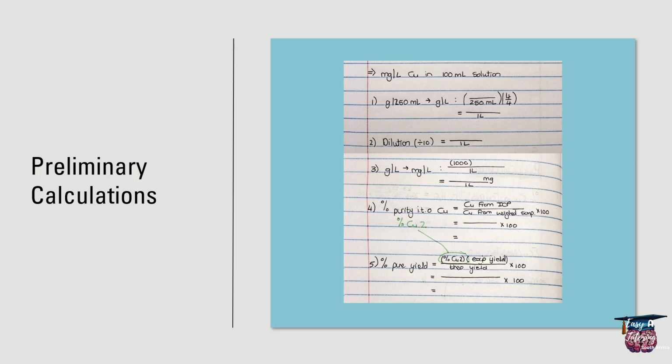Now, once you're in the lab, and if you have someone that checks your lab book, it's also useful to already have this set out, because when they check your preparation, they can have a look at these sections, and if you've made an error somewhere, they can help you fix it, so that you know that once you leave the lab, you already have everything well set up so that you can do your post experimental analysis correctly and add correct results into your report.